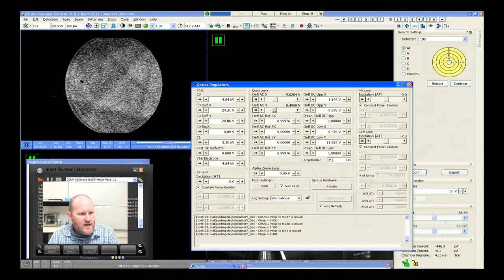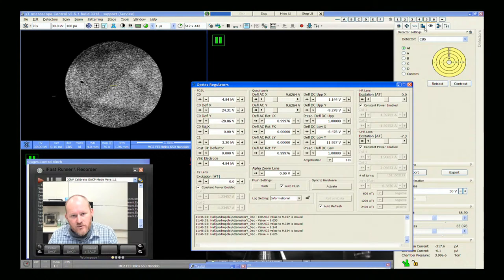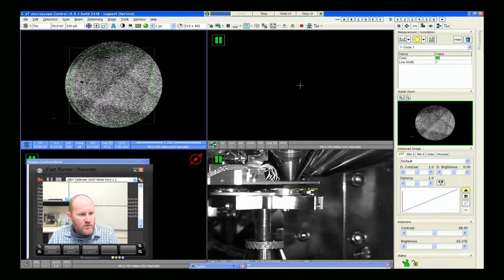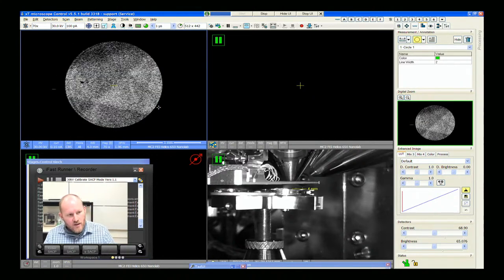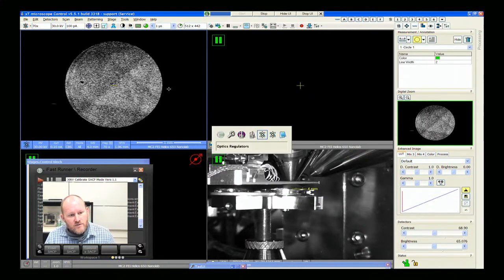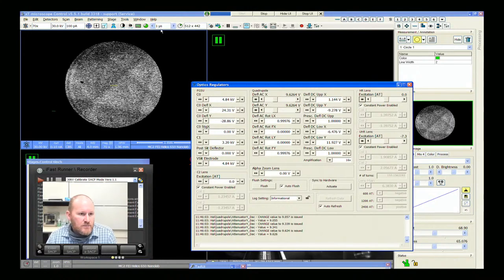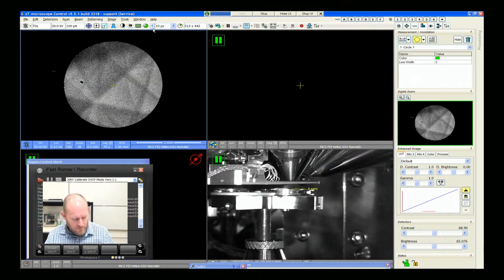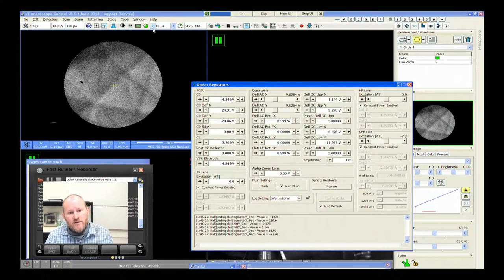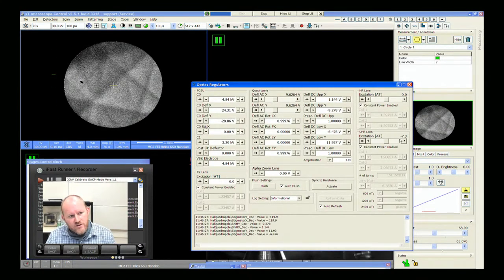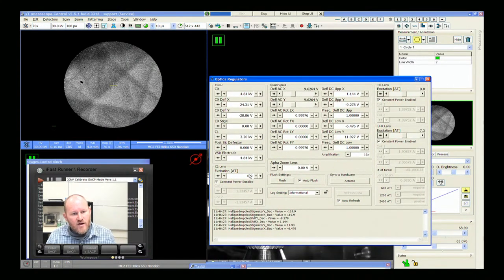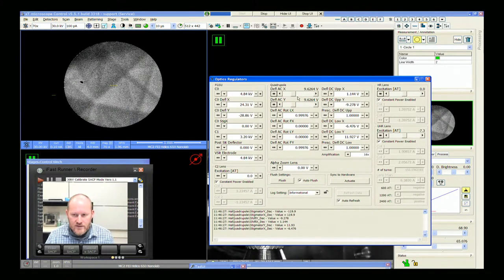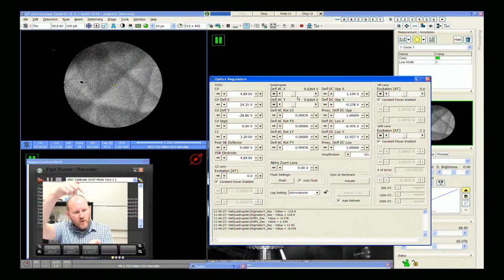When we really want to be quantitative about this, one thing you can do is come to the annotation and draw a circle, so we have a perfect circle — then I will change the scanning values so that we have a perfect circle. Looking back at the optics regulators: our HR lens is off, our UHR lens is off, and of course C2 is off. We're focusing and scanning up at the gun — the eight quadrupole ACs. So we now have just a really ultra-long working distance SEM image.